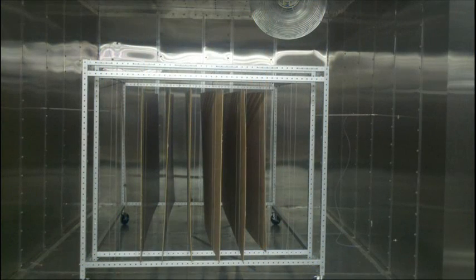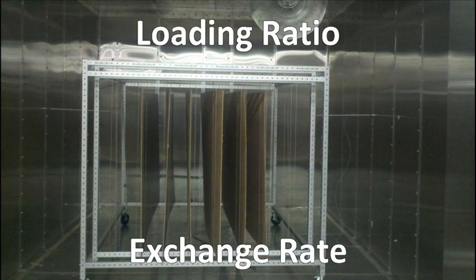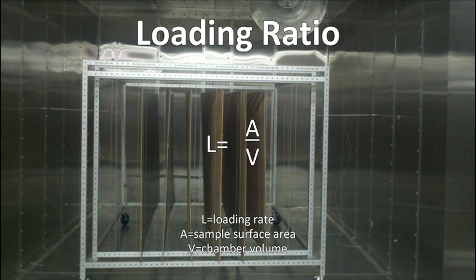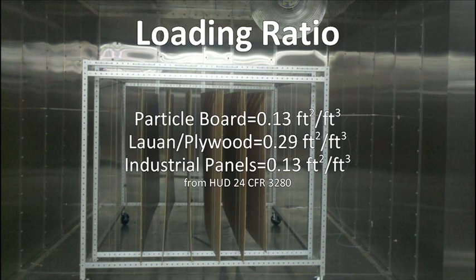There are two main considerations when conducting the test: loading ratio and air exchange rate. The loading ratio is the total exposed surface area of each product divided by the test chamber volume and typically is different for different types of products.